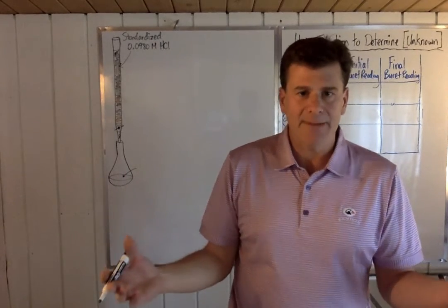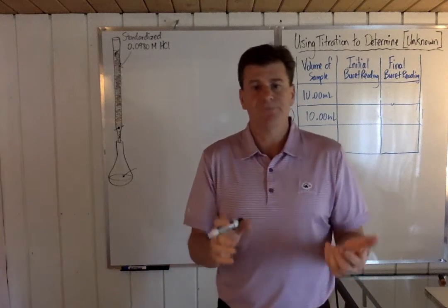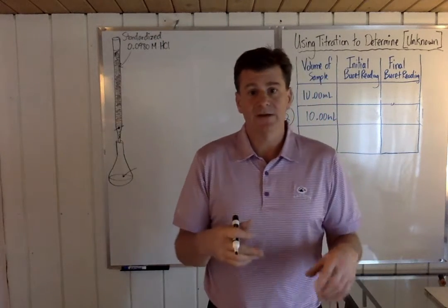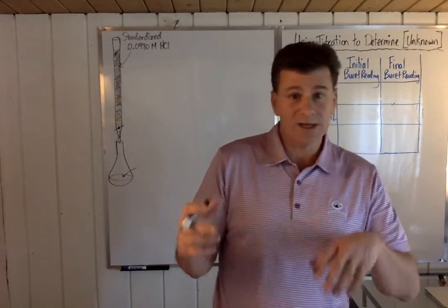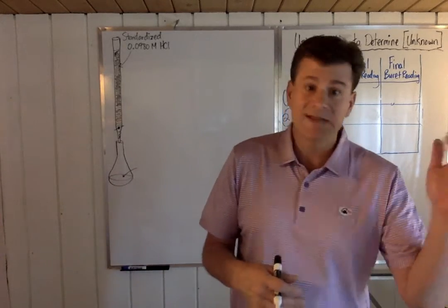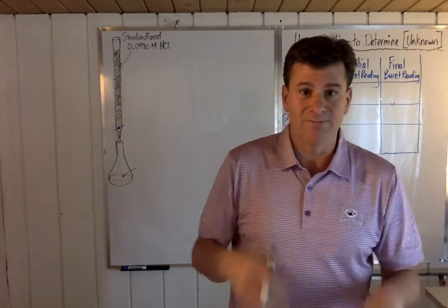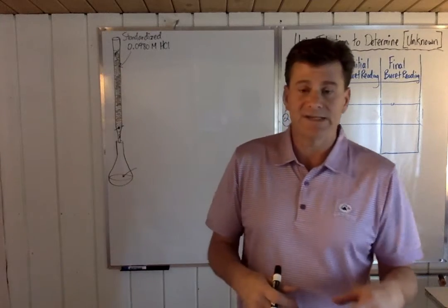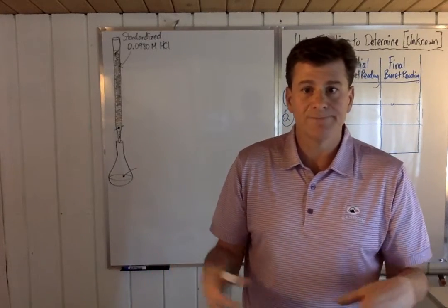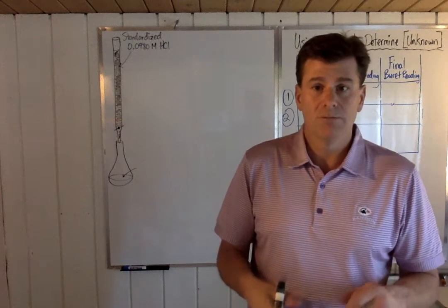When it's HCl, typically what happens in a chem lab is we receive bottles of concentrated stock solutions. Okay, so like we get a hydrochloric acid that is in the neighborhood of a 30% HCl solution. So molarity wise, we're talking somewhere in the neighborhood of 12 to 16 molar. So we're talking nasty stuff. You open that bottle, if you take a whiff of it, the vapors themselves start to burn your nasal membranes. It's really nasty stuff if you happen to have really concentrated HCl. So we have this really concentrated stuff, and in a fume hood, obviously, we dilute that to whatever solutions we want. So let's pretend we've taken our stock solution and diluted it so that it's 0.0980 molar HCl.